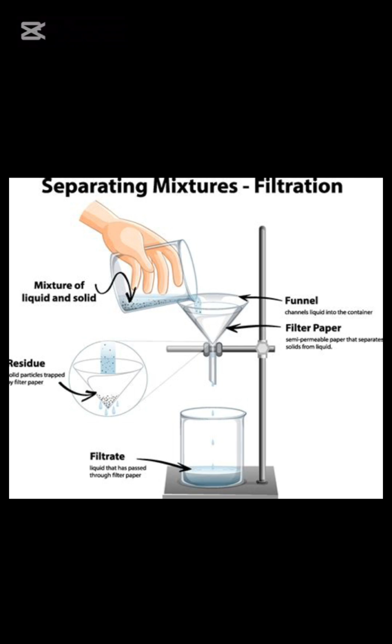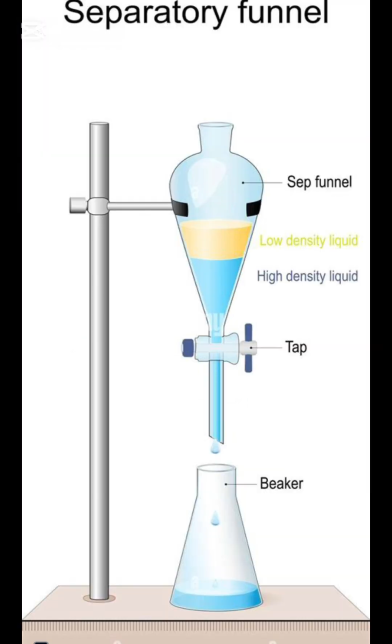This technique can be used to separate mixtures of sand and water, chalk and water, mud and water, and so on. Simple, right? That's great. Finally, we look at separating funnel, or you can call it separation funnel.